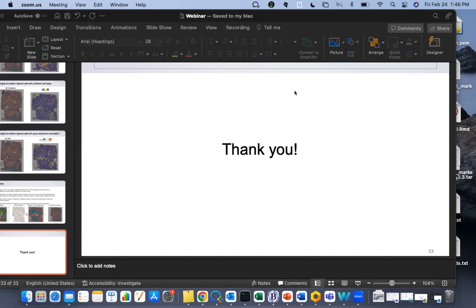So the final goal is to cover all of it. It does, so if there was another spot over, it could have a different selection of genes that were expressed in that part of the tissue. The overarching goal was to give the highest coverage. So given a spot, you have the same set, but we're only detecting what's biologically relevant or present there, right?